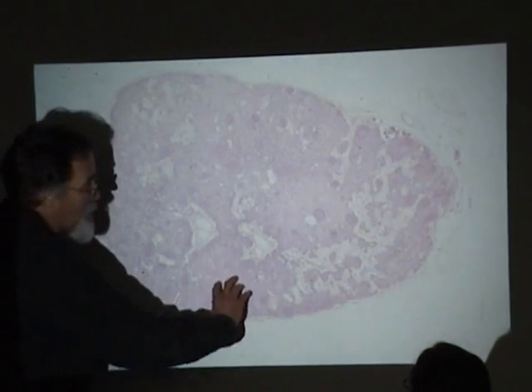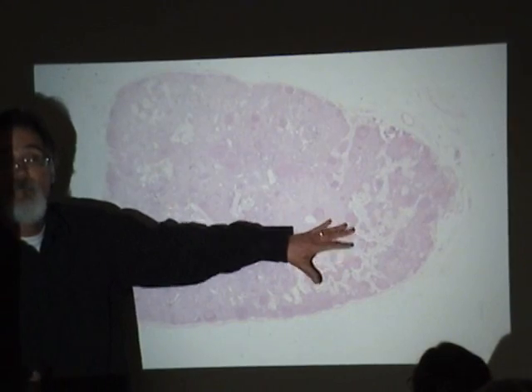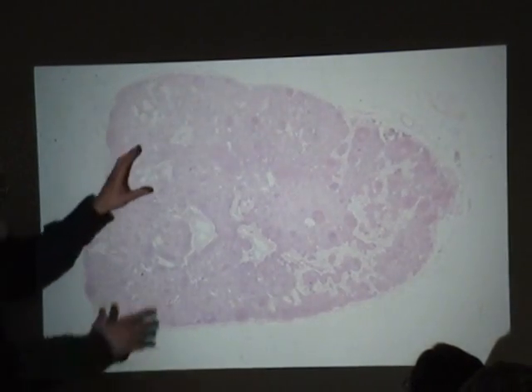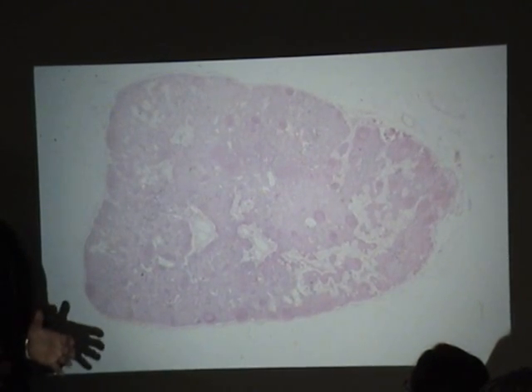This is clearly cortical. As you get down, this is medullary, right? And this could be close to the hilum where you have things moving in and out. Cortical, right in here, medullary. You've got clearly follicles in here, but again, it's plane of section issues, okay?